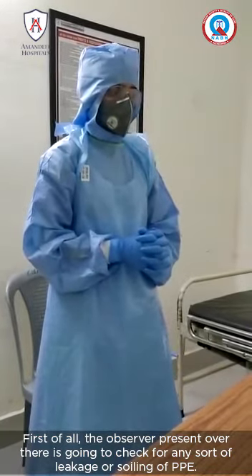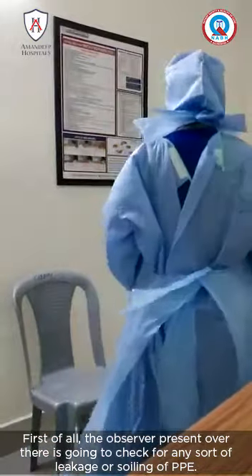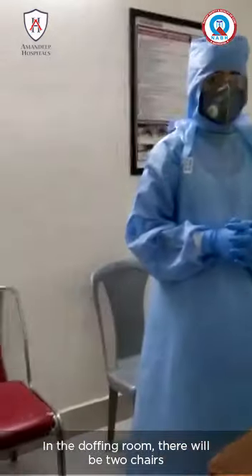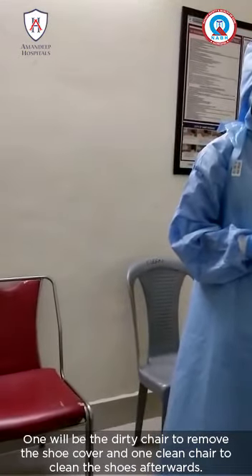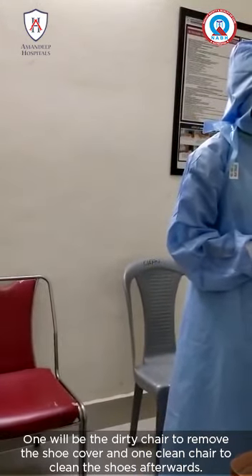First of all, the observer present will check for any sort of leakage or soiling of PPE. In the doffing room there will be two chairs: one will be the dirty chair to remove the shoe cover, and the clean chair to clean the shoes afterwards.